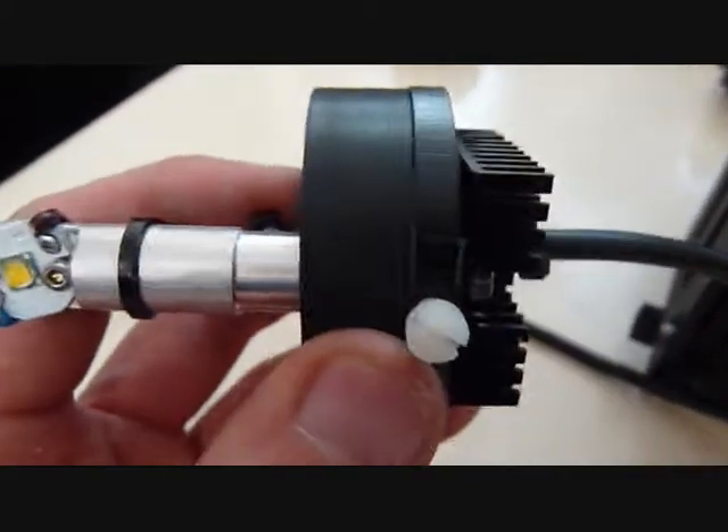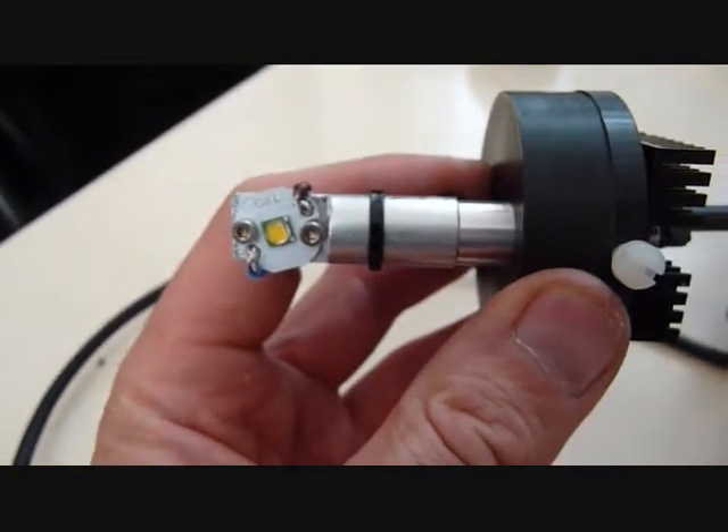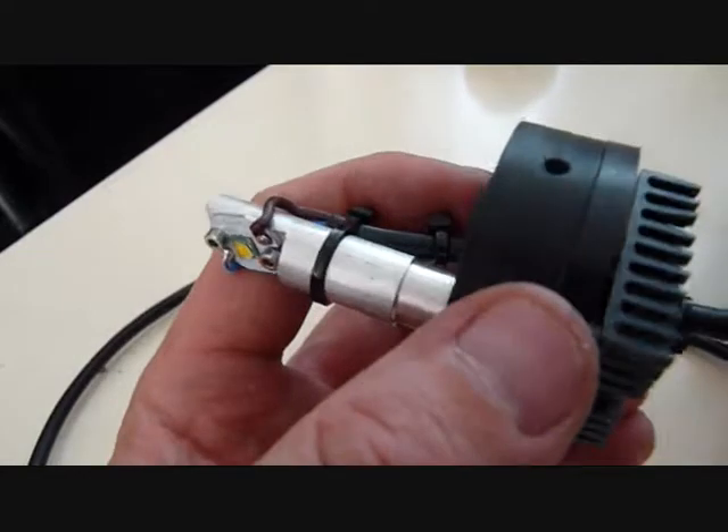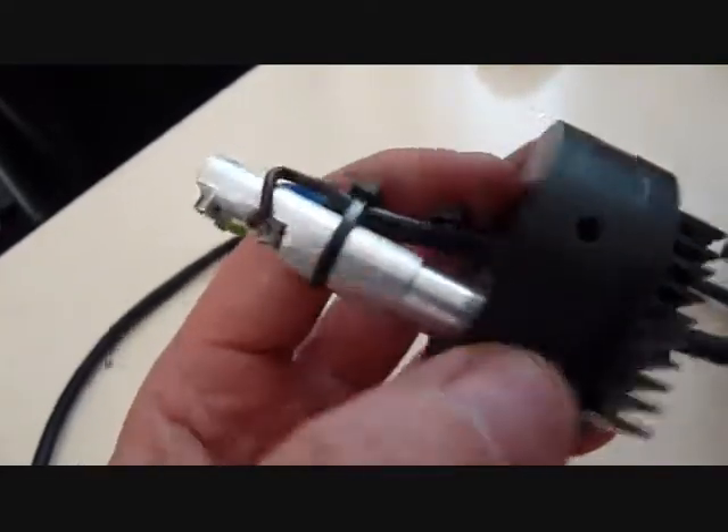If you loosen this screw here, you can move the LED to the left and right. So it gives a similar range of adjustments to the original halogen bulb. And obviously it rotates on the housing just the same.